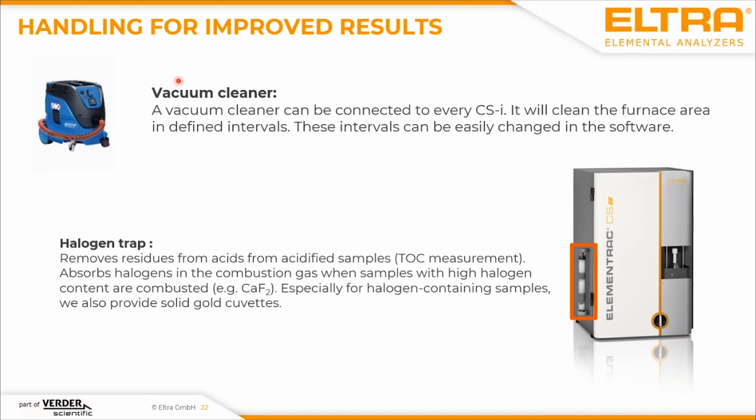Then we have a vacuum cleaner. The vacuum cleaner option always comes with the instrument, which means you can attach a vacuum cleaner, which you have to buy separately, to get the dust out of the instrument, which we normally propose for samples which are dusty. So you have to check by yourself if your samples are dusty when they are combusted.